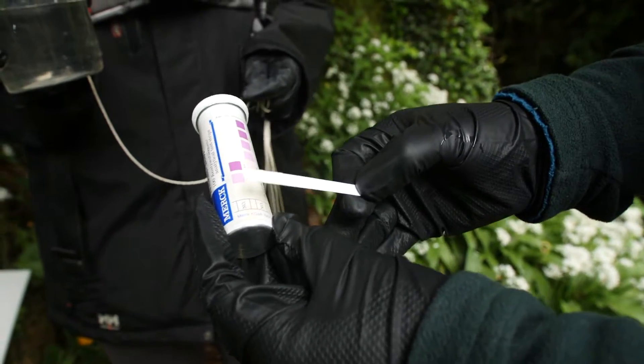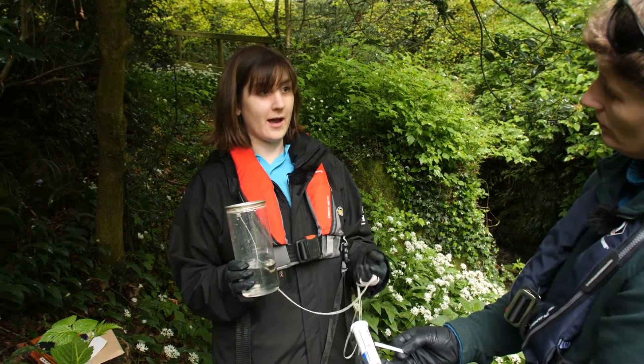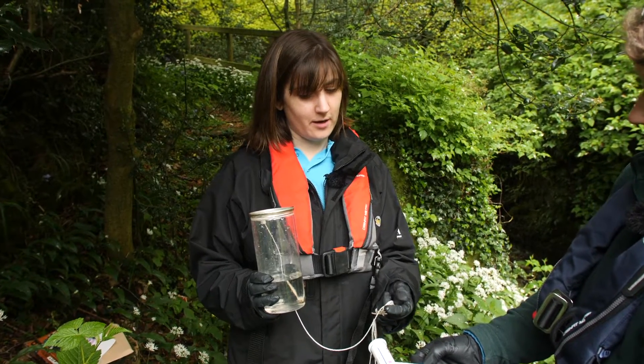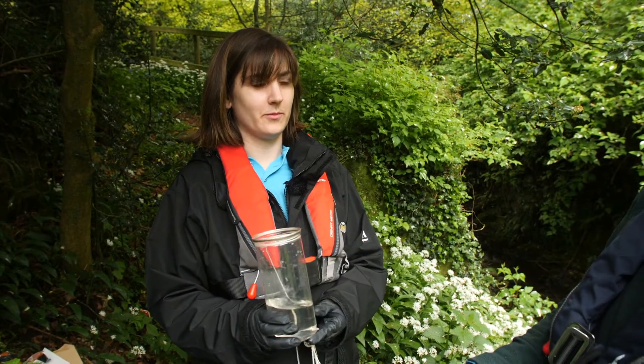Do you use this type of kit in the field? Often in the field we'd take a sample and send it to the lab, because we'd get a more accurate reading. This would tell you generally where your nitrate is, whereas the lab would give you a precise, accurate concentration.